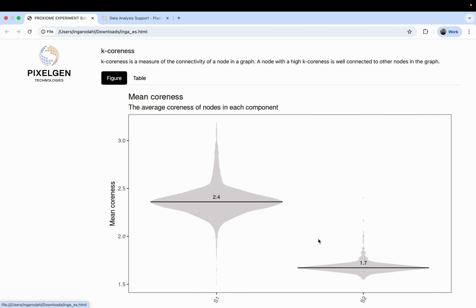You can also look per cell type, and we can then confirm the annotation again with, for example, CD3, which is expressed on the T cells. In these plots, it's only some major cell populations that have been shown. So if you're missing your favorite cell type in this experiment summary, you can always look at it in the downstream analysis. But this can at least give you a nice indication and confirm any potential annotation.